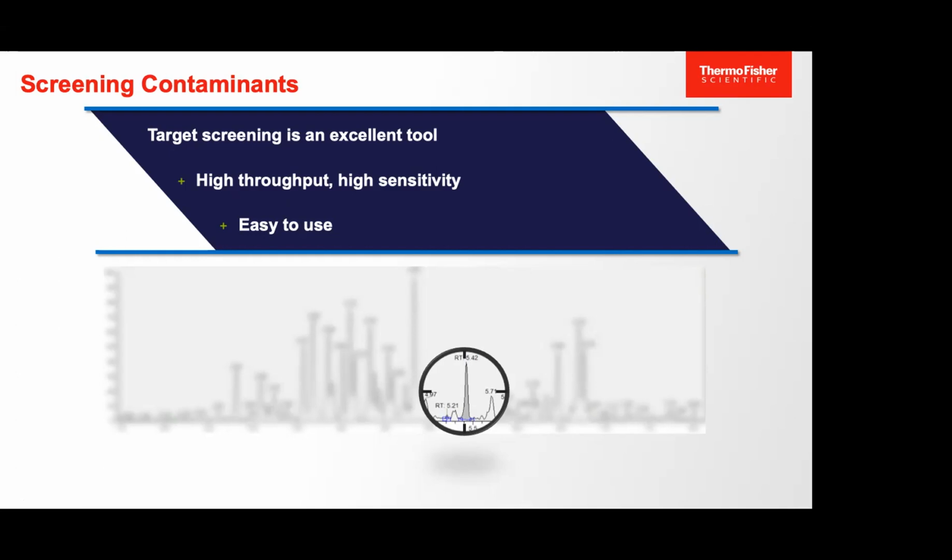So why are we moving technology from a basic system to a high-end system? Just like our handphone. Why do we keep upgrading our handphone? Why are we buying a new handphone? Because we want to take nicer pictures. You want the handphone to be able to scroll up and check your Facebook updates faster. That's the technology. So why we need a high resolution system is we want to be more selective and sensitive.